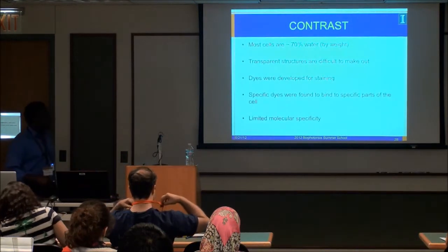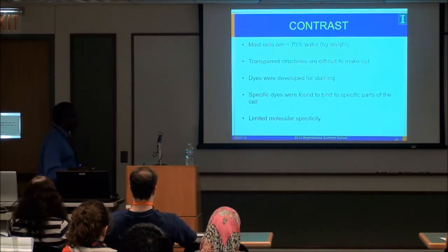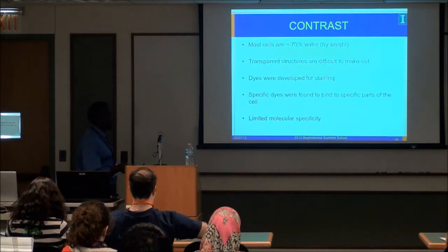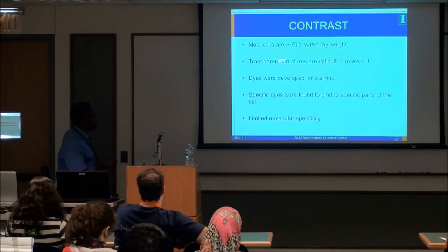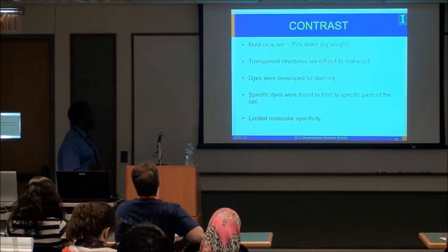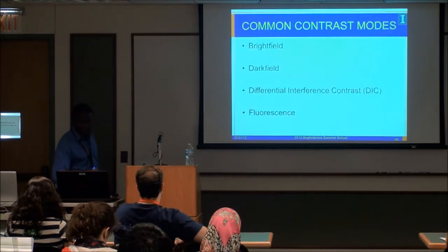So much of this I came into as the tail end of Professor Popescu's talk, so there's some overlap. I'll try to quickly speak on that only roughly. So basically, contrast is just as important as resolution. And most cells are transparent, and we give reasons as to why. So as a result, there are different contrast techniques that have been developed.